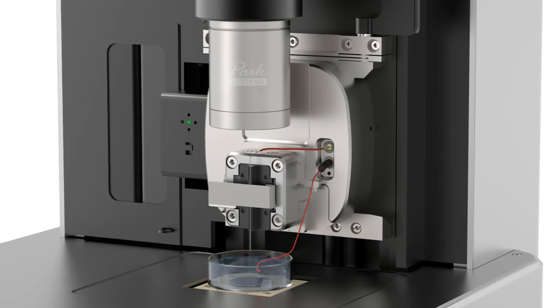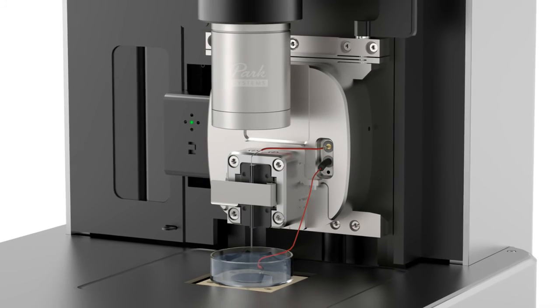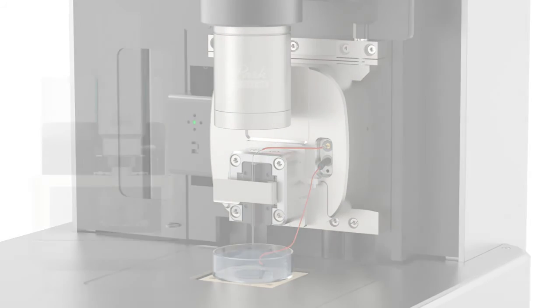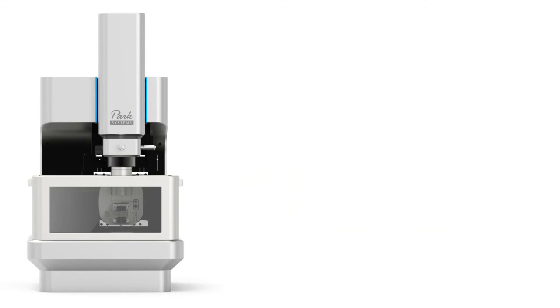Together, the PARC-NX10 and the SICM module work together to enable your nanoscale advances in four distinct and exciting ways. One, to protect the integrity of your sample as it is scanned in liquid.